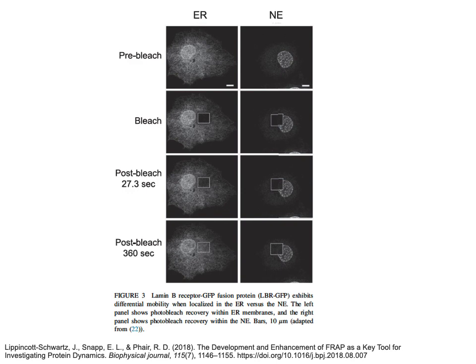Okay, so another factor besides lens quality and maybe your vibration table and the computer setup that would cause an increased cost is the number of lasers. Confocal microscopes could have as few as 2 lasers. Generally, they have at least 4 lasers nowadays, and that gets you up in price.